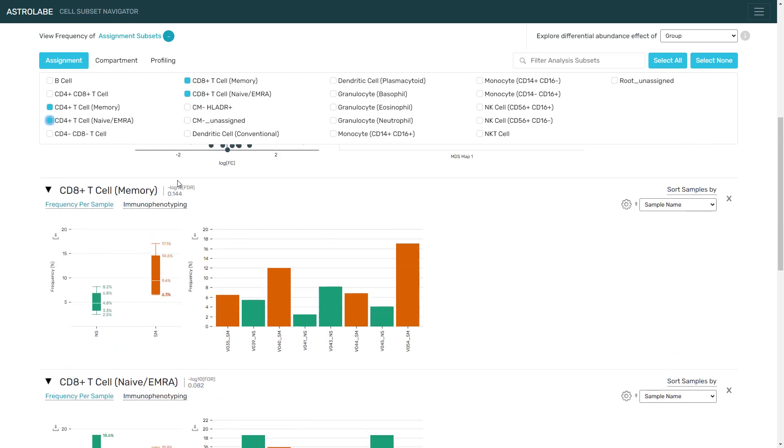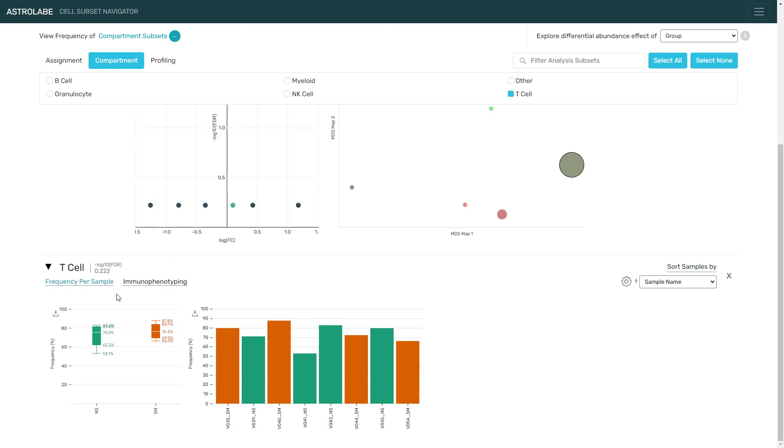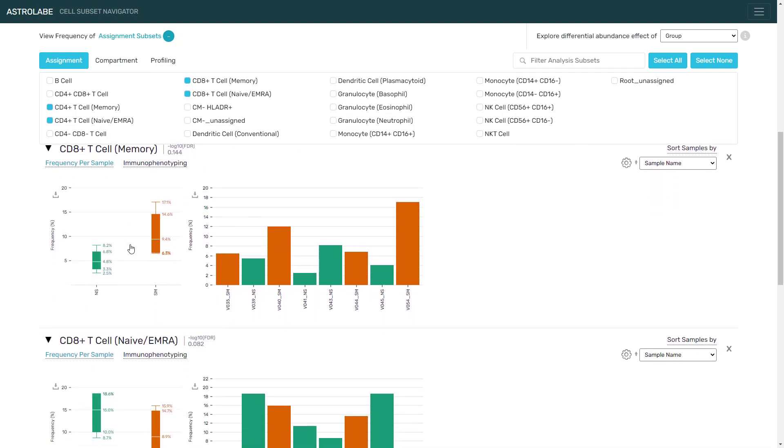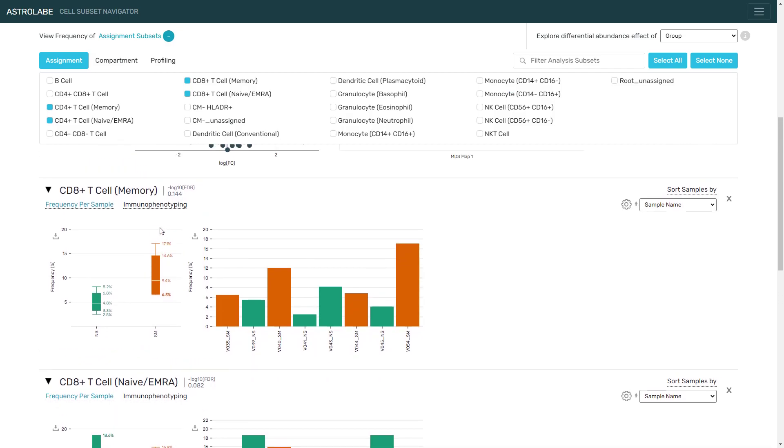We can take a step back by clicking on compartment, and now we're comparing the T cell population as a whole, and you will notice that these are pretty similar. In other words, there are no major differences in the entire population of the T cells. However, when we look at the memory and naive separation, there is an increase in the memory compartment across both CD4 and CD8 T cells.